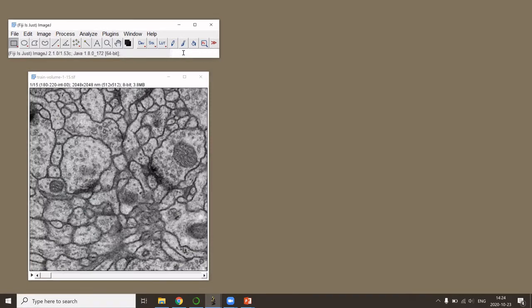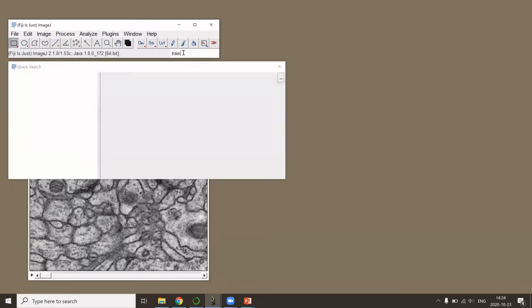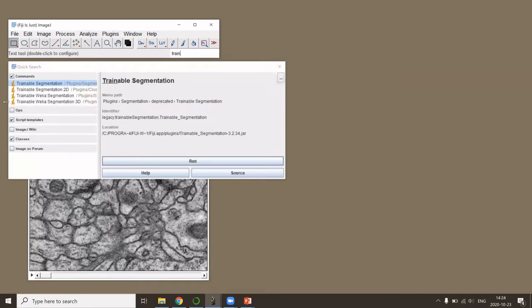Then I call the Trainable Weka Segmentation plugin.